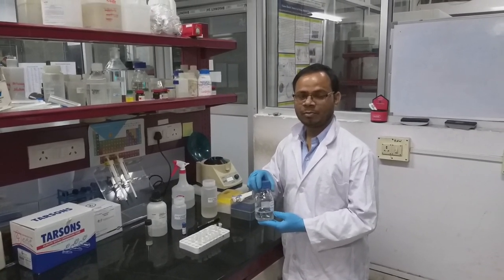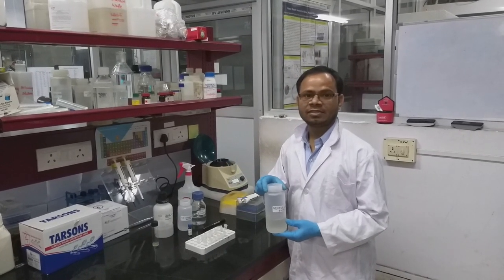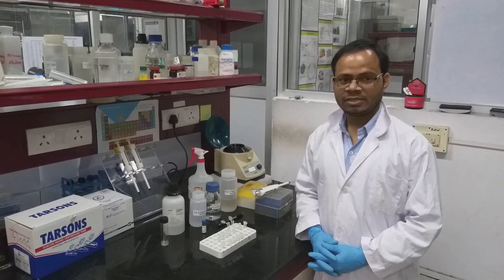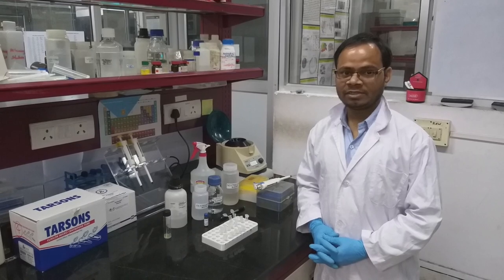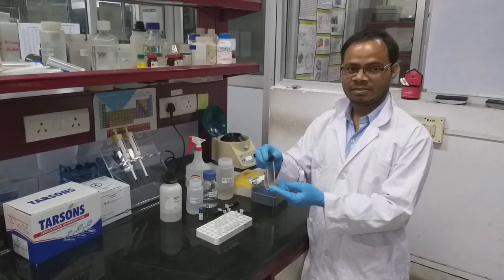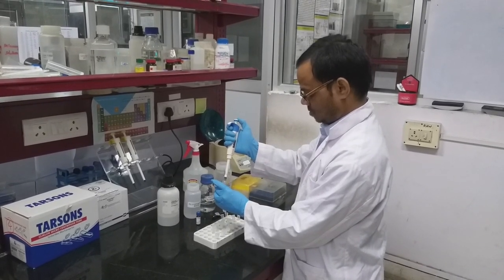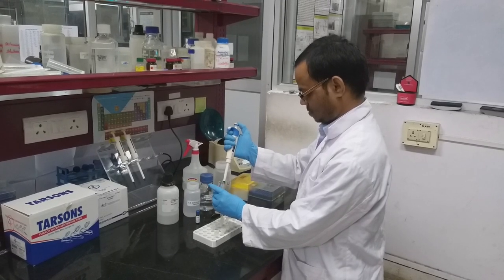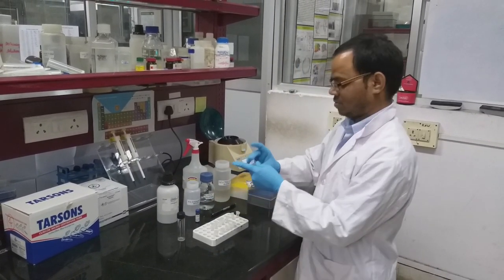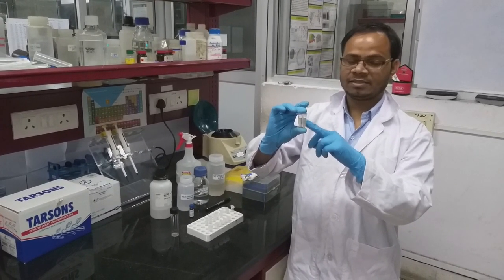Lysis buffer contains 0.2 normal sodium hydroxide and 1% SDS. Neutralization buffer contains 3 molar potassium acetate, pH 6.0. For isolation of plasmid DNA, we need an overnight grown culture with an OD of 3.0. So this is already a cultured one. We have to harvest the cells by centrifugation. These vials we have to centrifuge at 11,000 RPM for at least 1 minute to get the cells precipitated.